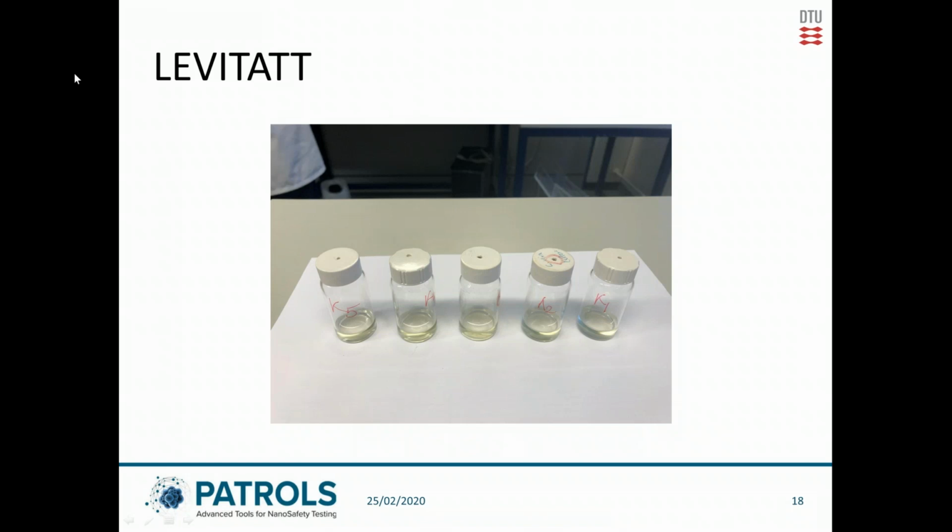We are using 20 milliliter scintillation vials with 4 milliliters of media inside where the algae is also situated. This enables a steady and nice CO2 flux throughout the test, which also ensures a stable pH. Also, when we're using small vials, we can increase the number of replicates per concentration, and the small size also ensures that we have sufficient biomass in order to determine the cell concentration.